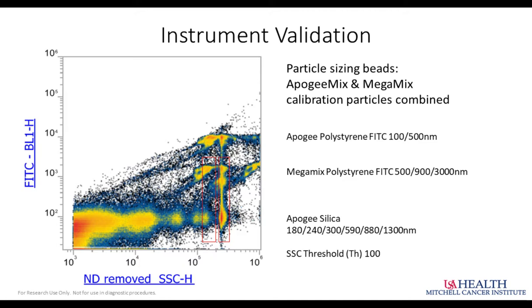Much below 10 to the 4th is really pretty much considered electronic noise. The large orange portion in the corner is probably the electronic noise, and then perhaps that next cloud over would be our 30 nanometer background particles after doing the ultrafiltration.